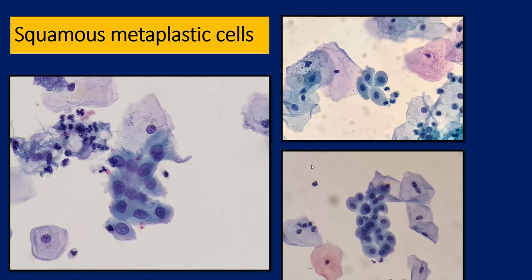The next group are squamous metaplastic cells. These have angulated ends and are present in aggregates of various sizes, or sometimes singly. The nucleocytoplasmic ratio should be less than 50%; once it exceeds 50%, we start thinking in terms of squamous intraepithelial lesions and atypical squamous cells. Metaplastic cells can sometimes show spider-like processes, with a little bit of hyperchromasia and irregularity, which can be acceptable.